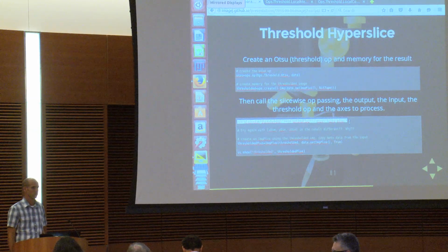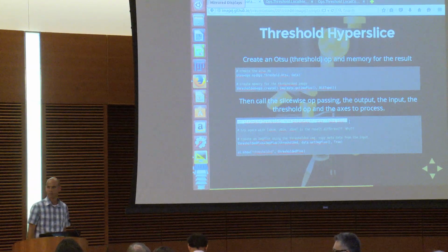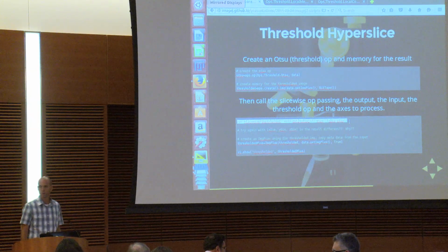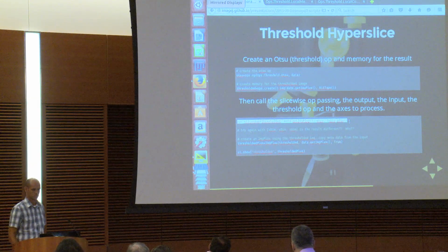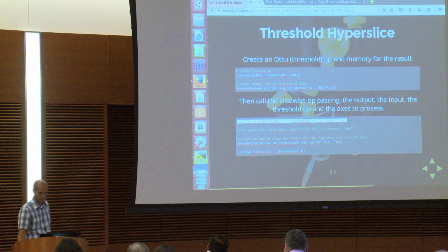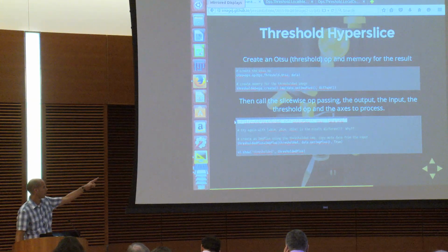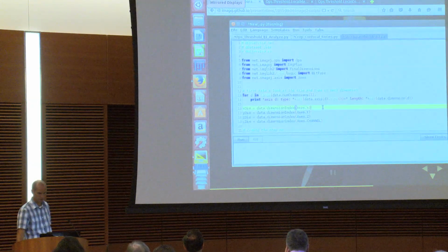Yeah, similar. That's why we named it. Yeah, it's a common naming. That is exactly what Brian is showing. That op is called slicewise, and it is right there. And yes, perfect. That's why he's bringing this up now, because it lets you define the subregions. Yeah, and so that's what I'm using right there, the highlighted code, because we zoomed in here.